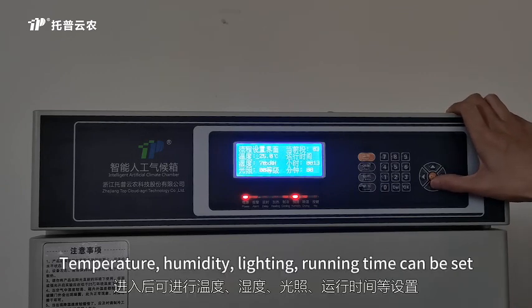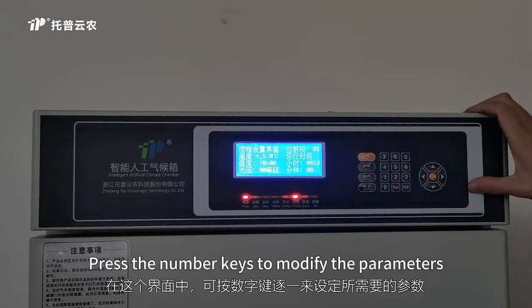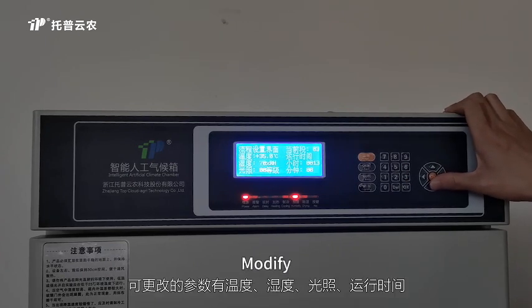Temperature, humidity, lighting, and running time can be set. Press the number keys to modify the parameters. The cursor blinks. Enter a number to modify.